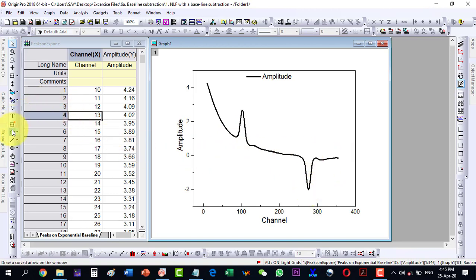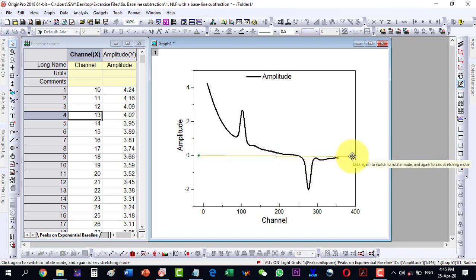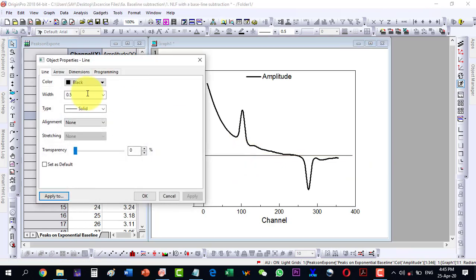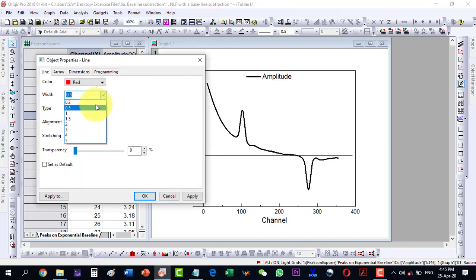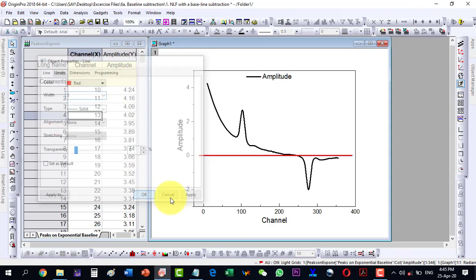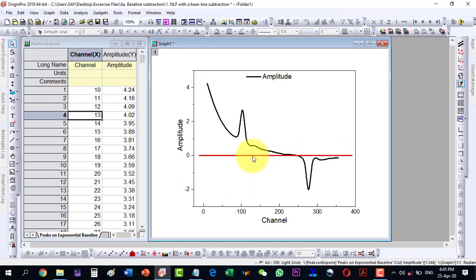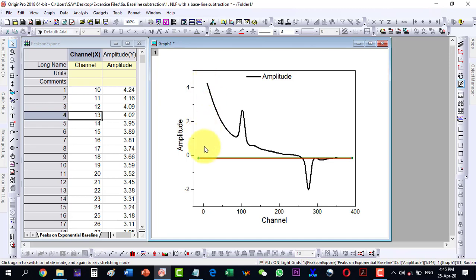We can check this by drawing a line. Let's drag a zero line from here, and by using the arrow keys we can remove any bending so it is flat. Changing its color and size makes it more visible. We can now see that if this is the zero line, then certain points should be shifted down — that will be baseline corrected.